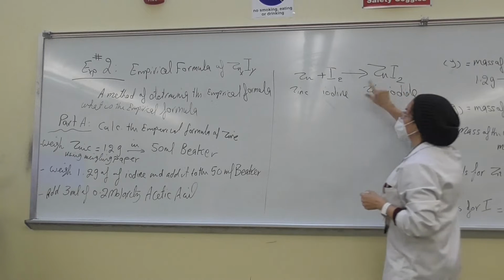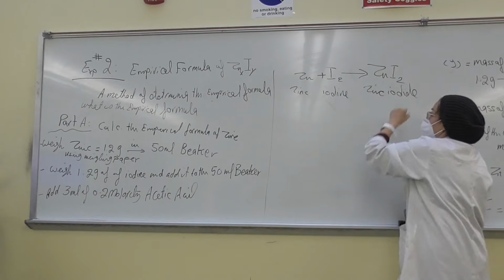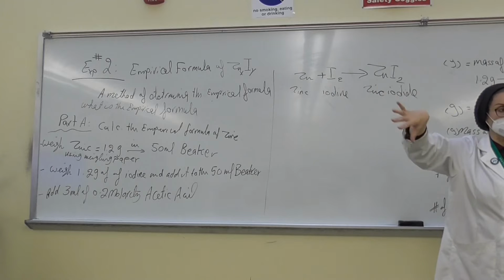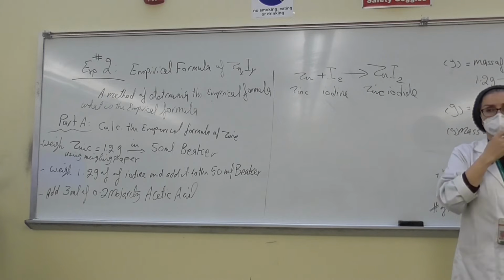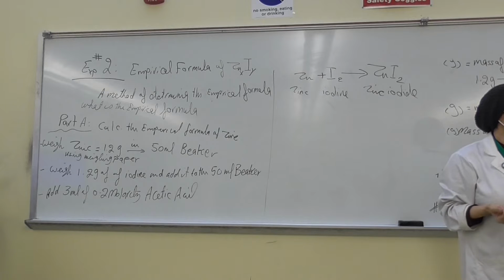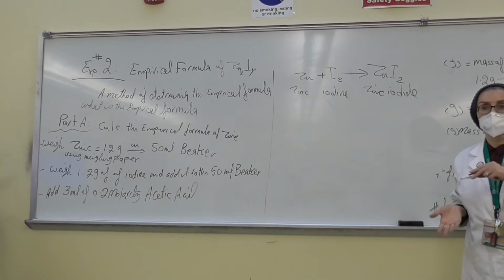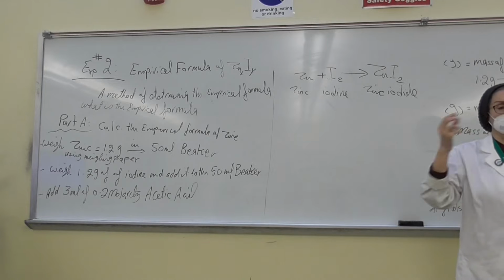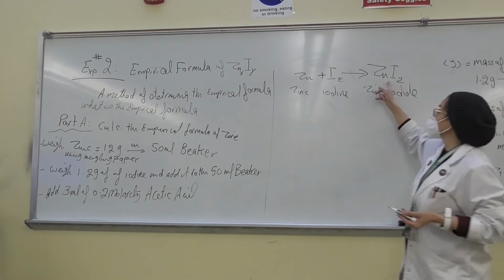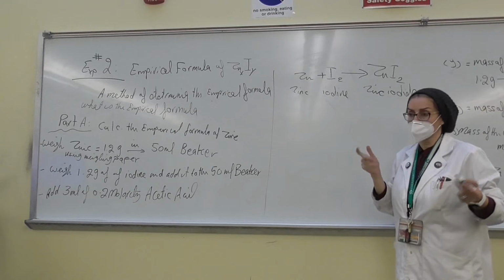But we don't know exactly what is X and Y. In other words, this is what we are going to project, right? Expect. But sometimes with human errors, when we transfer from one container to the other, we're going to have some errors. So sometimes this ratio might be different.